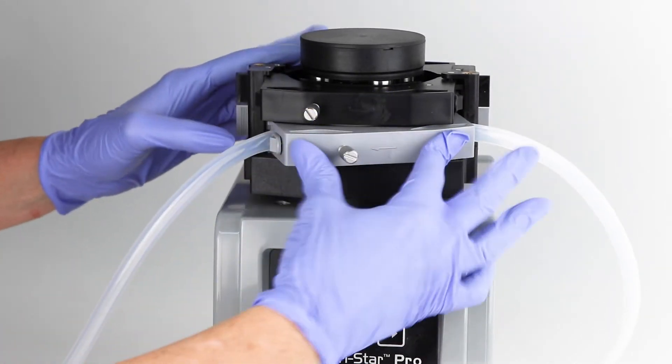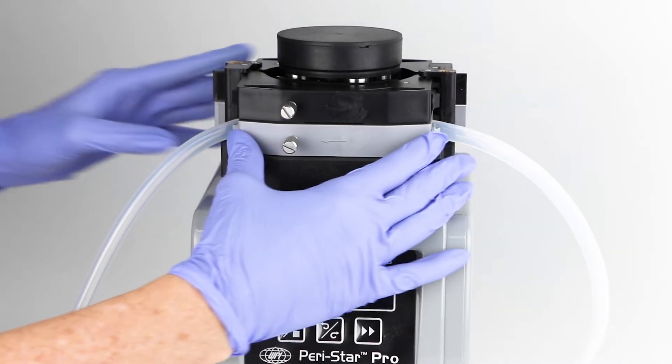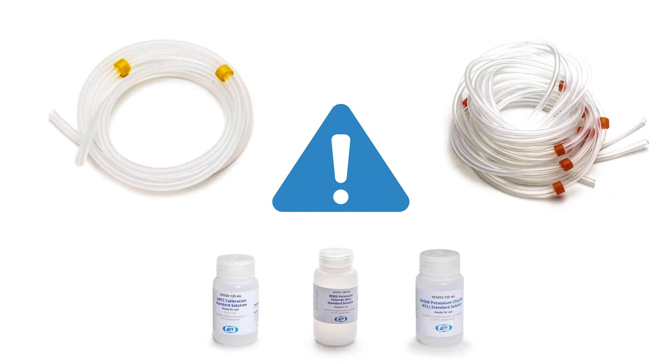Change the tubing immediately if it is visibly worn. Be sure the tubing used is compatible with the solution being pumped.